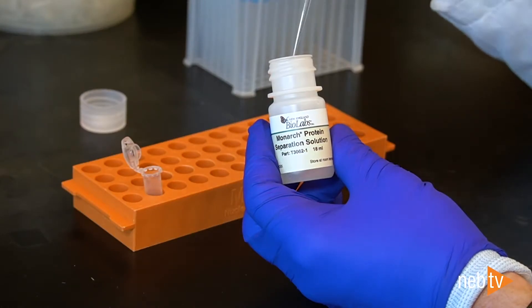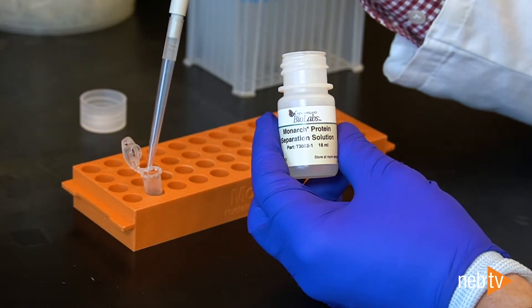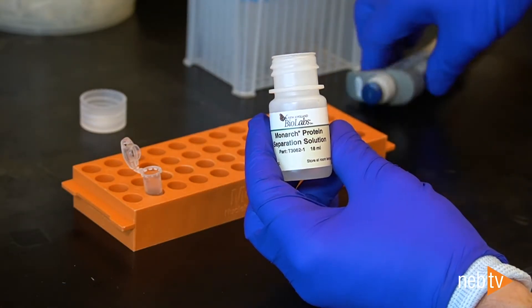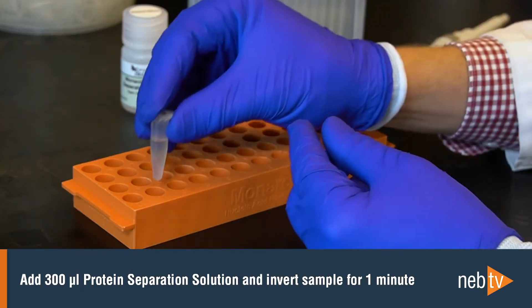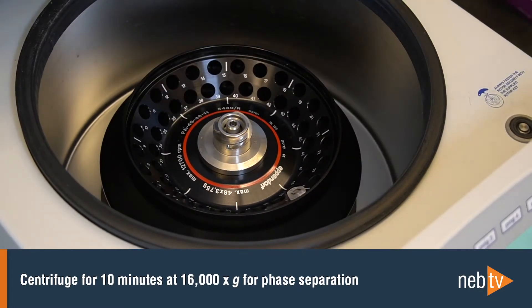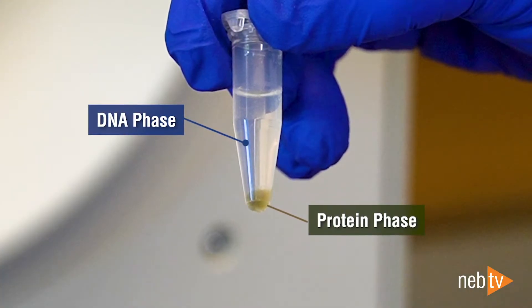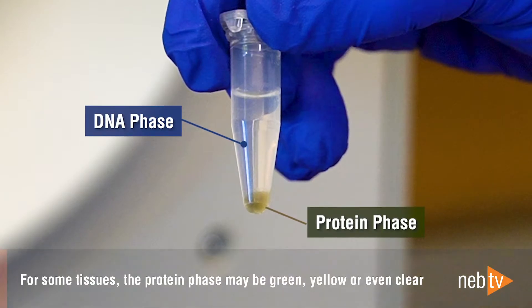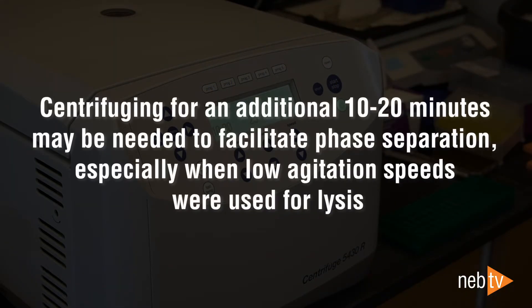After this incubation, the lysis is complete, but the proteinase K treatment typically does not remove all of the protein. Therefore, an additional protein removal step is needed before the DNA can be bound to the beads. Add 300 microliters of protein separation solution and invert the sample for one minute. Centrifuge the sample for 10 minutes to create a phase separation. The sample will separate into a large, clear phase containing the DNA on top and a smaller, often brown phase containing the protein on the bottom. For some tissues, the protein phase may be green, yellow, or even clear. Sometimes additional centrifugation time may be needed to facilitate the phase separation, especially if low agitation speeds were used during lysis.